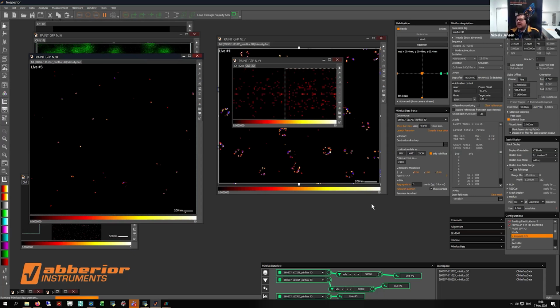For this, we can be much faster in the localization with the big MINFLUX system, as we can call this, compared to the Abberior MIRAVA, which allows us very fast tracking. And I would comment on the tracking after Evelyn gave you a short introduction to that. Okay, yes, I'll talk to you a little bit about tracking.